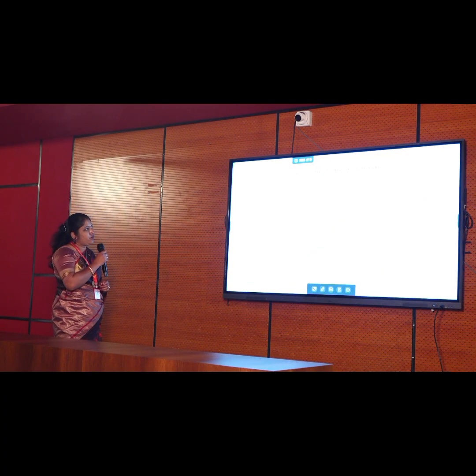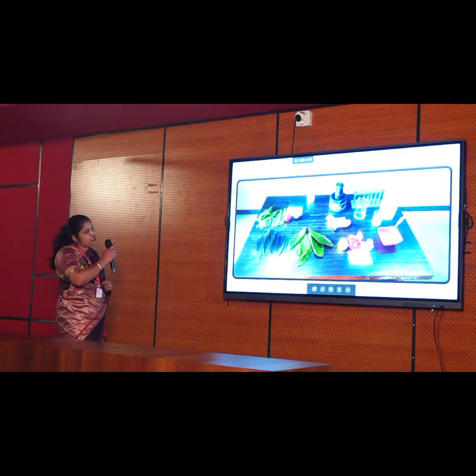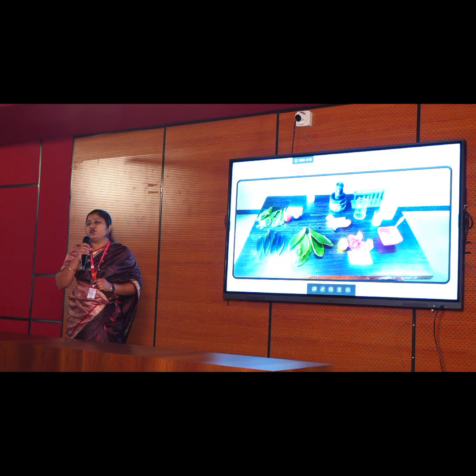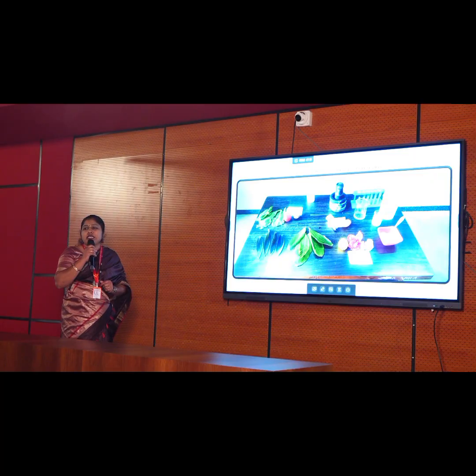Next. This is the benchmark we have set up for the students, and all the samples were very local, available in the surroundings. They brought the fruits from their homes, and the other samples were in our garden. We took them and did the extraction.